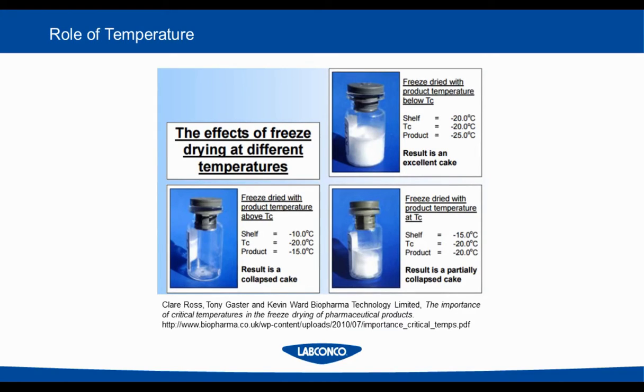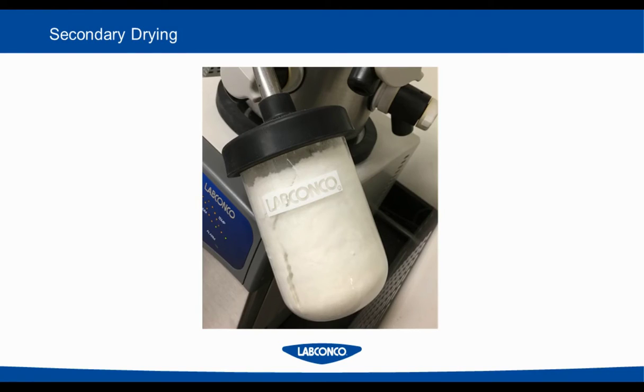The ability to run primary drying at higher product temperatures greatly reduces drying time by creating a larger pressure differential between the vapor pressure over ice in the product and the pressure at the condenser. Each 1 degree increment increase in product temperature can decrease primary drying by 13%.